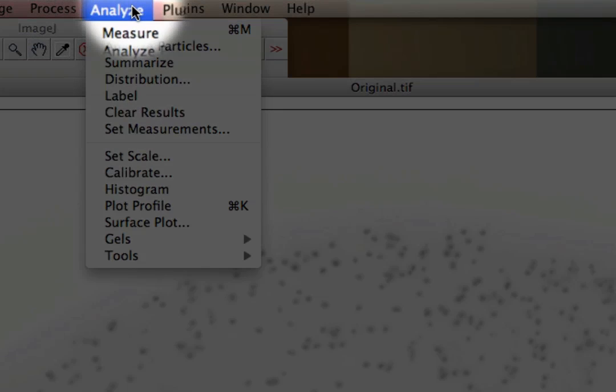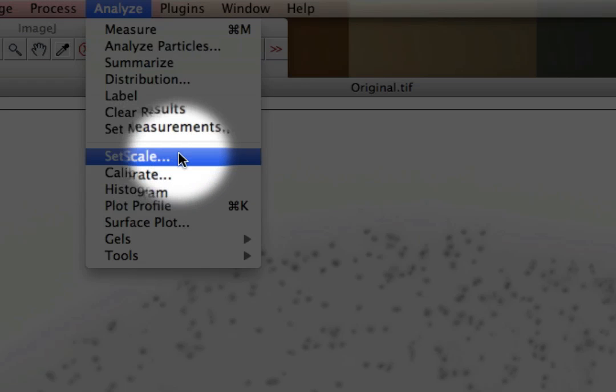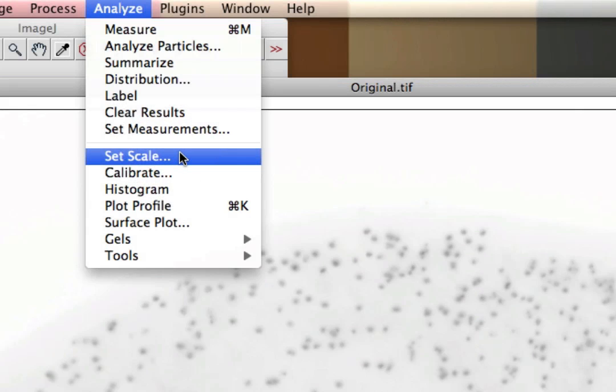In order to do that, we have to take a couple different steps to make sure this works properly. We're going to use the Analyze tool, and from the Analyze menu, the first thing we need to do is set the scale.